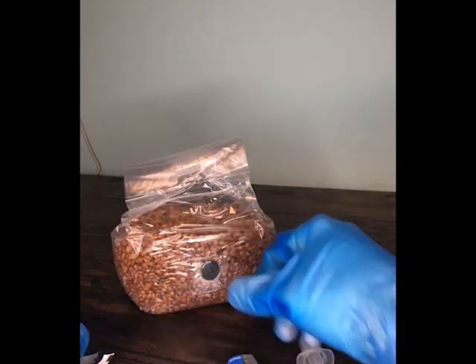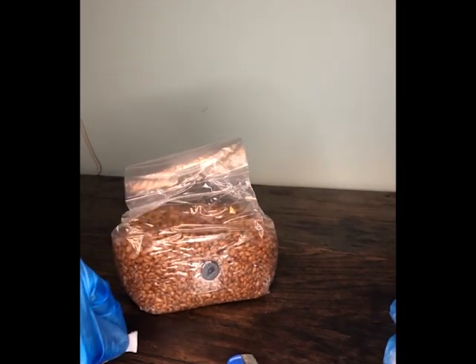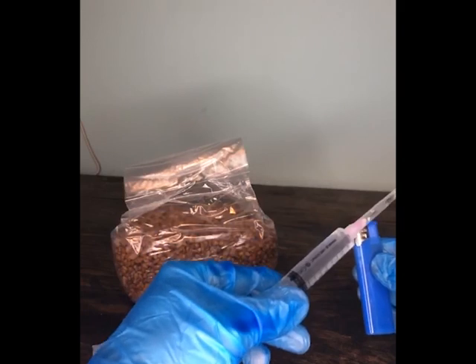One important thing to really remember here is the alcohol swab is highly flammable, so make sure that you keep it well away from the naked flame while you're flame sterilizing the needle.